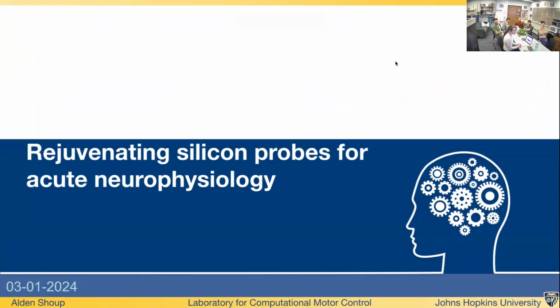Right. So this is a final update on the work I've been doing to rejuvenate silicon probes for acute neurophysiology. Almost a year ago, I gave the first presentation, and it's nice to be wrapping up and have the preprint out.